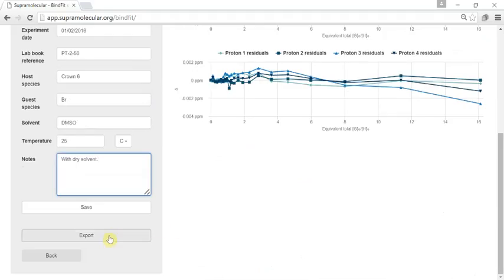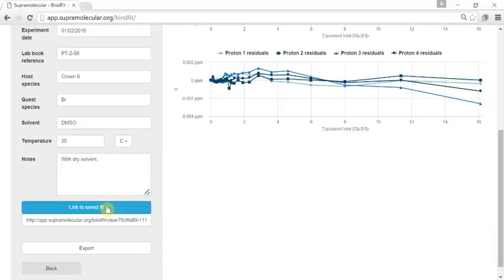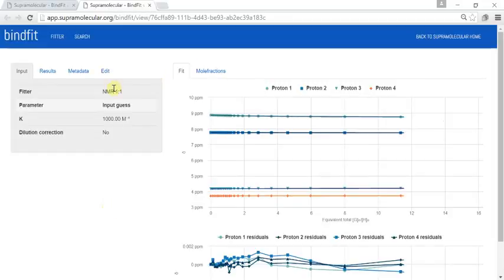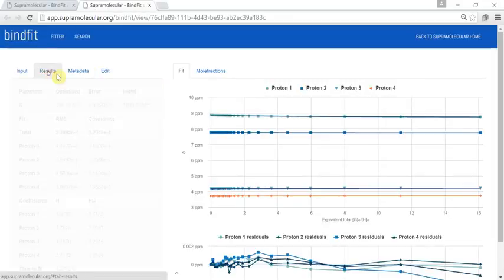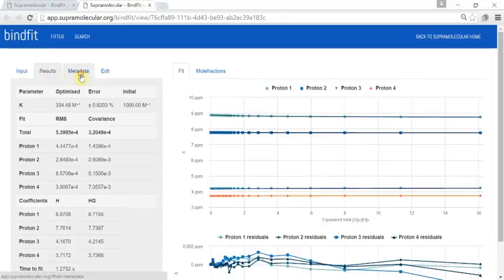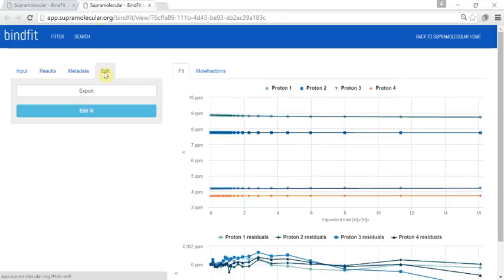Once you press save, we will export it directly to Excel if you want. It will also create a unique URL which you can either retrieve, email, or keep somewhere. Once you put that back in the browser you will retrieve this data with all the associated information.